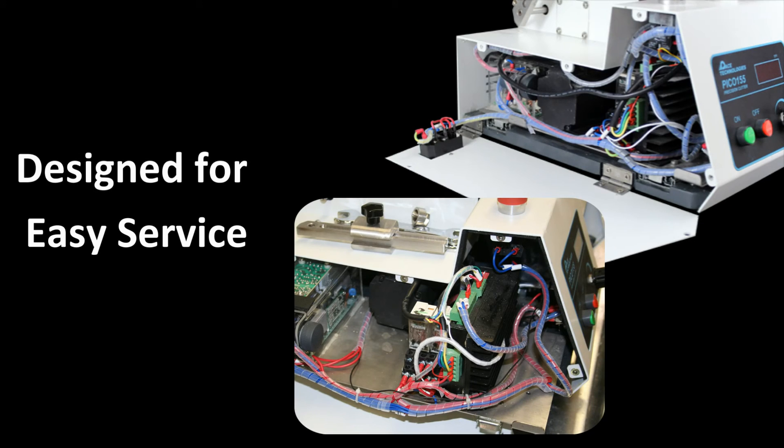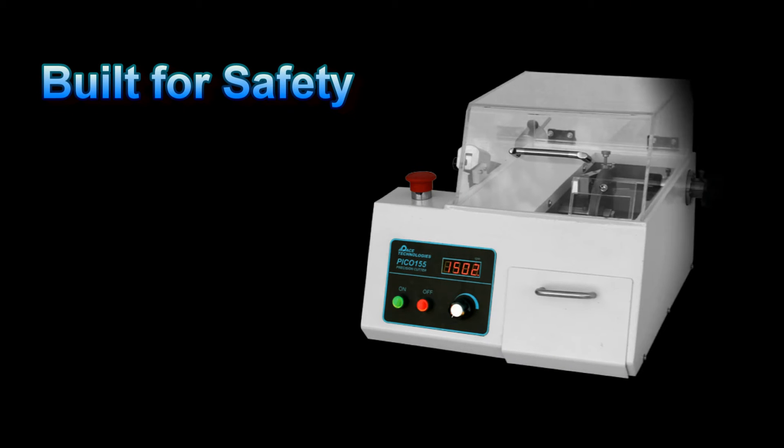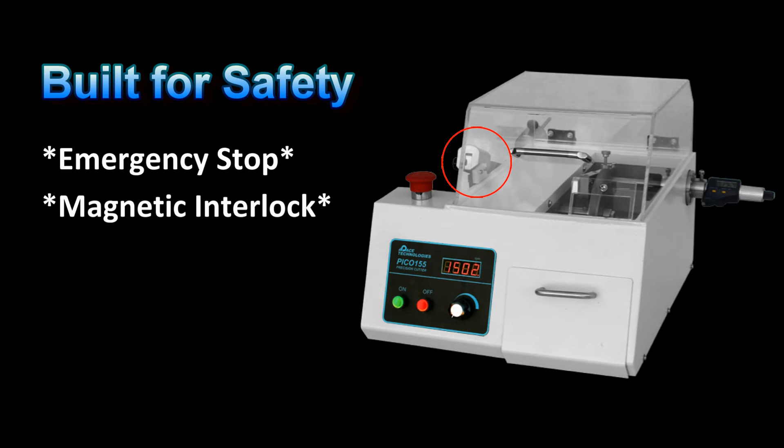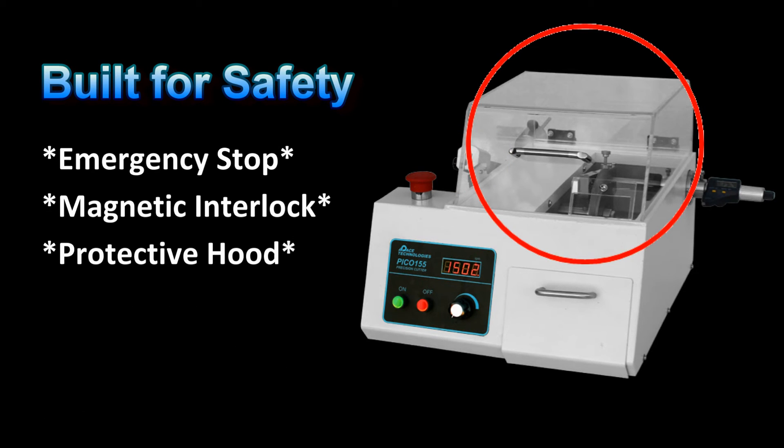The Pico 155 has also been designed for easy service. By opening the side panel, the electronic components are relatively easy to access and service if necessary. For safety, the Pico 155 features an emergency stop button, a magnetic interlock to stop the motor when opening the hood, and a shatter resistant protective cover.